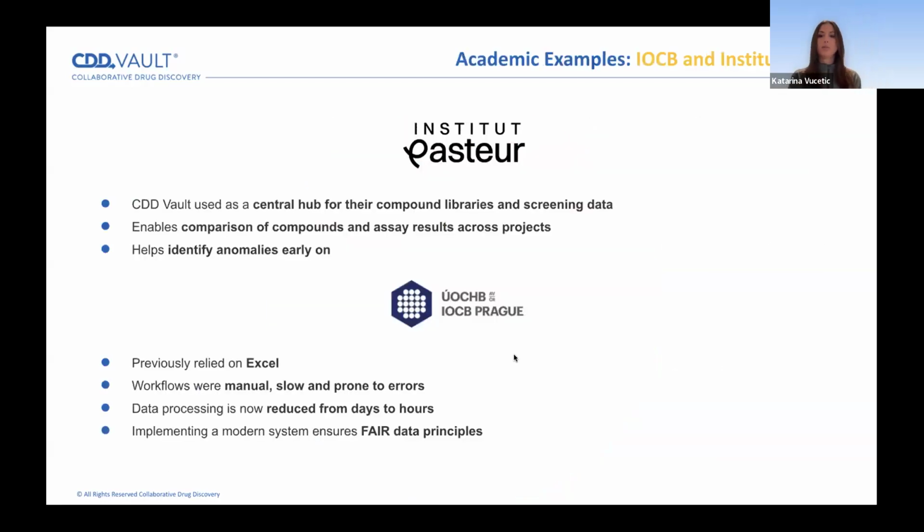And lastly, I would like to mention two academic examples. CDD Vault is used by more than 700 organizations to date across industry and academia. But here you can see two examples of institutes that are using CDD Vault, Institut Pasteur and IOCB in Prague. You may be familiar with these institutes.